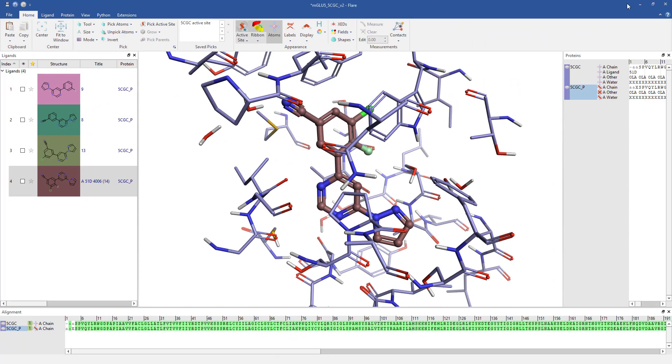EC maps give a visual indication of how well a ligand's electrostatics match those in the corresponding protein. This can help inform decisions as to how ligand functionality might be changed to improve protein ligand binding.